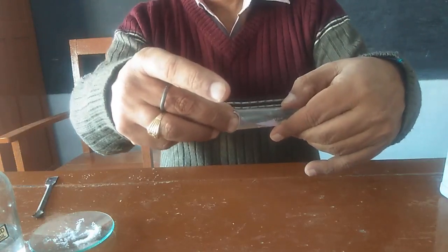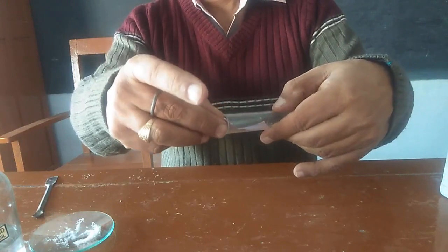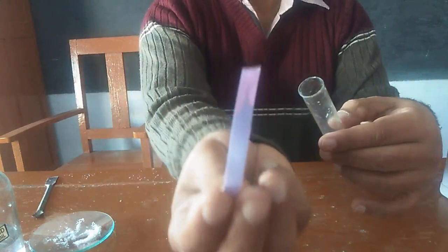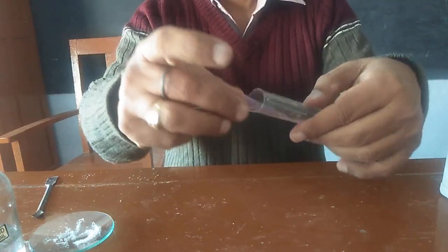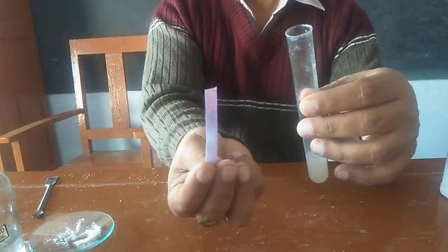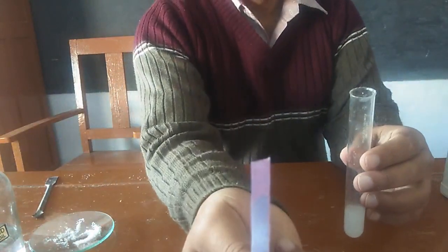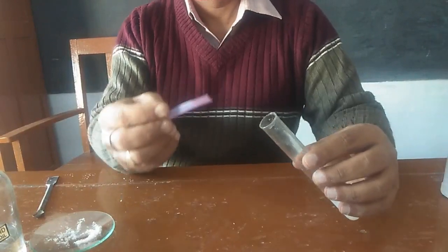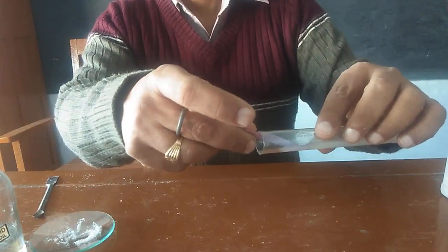You know, acid turns blue litmus to red. As soon as the solution comes in contact with blue litmus paper, the paper will change its color. We also know that acetic acid is a weak acid, therefore the red color of the litmus paper is not so dark. It is very light. It's a light pink color.